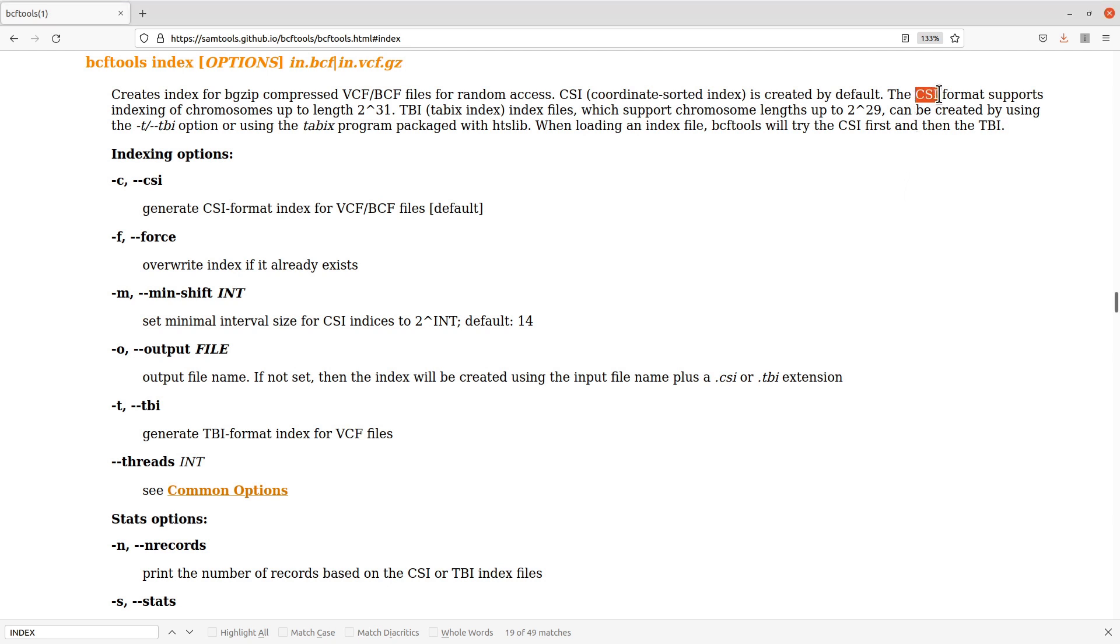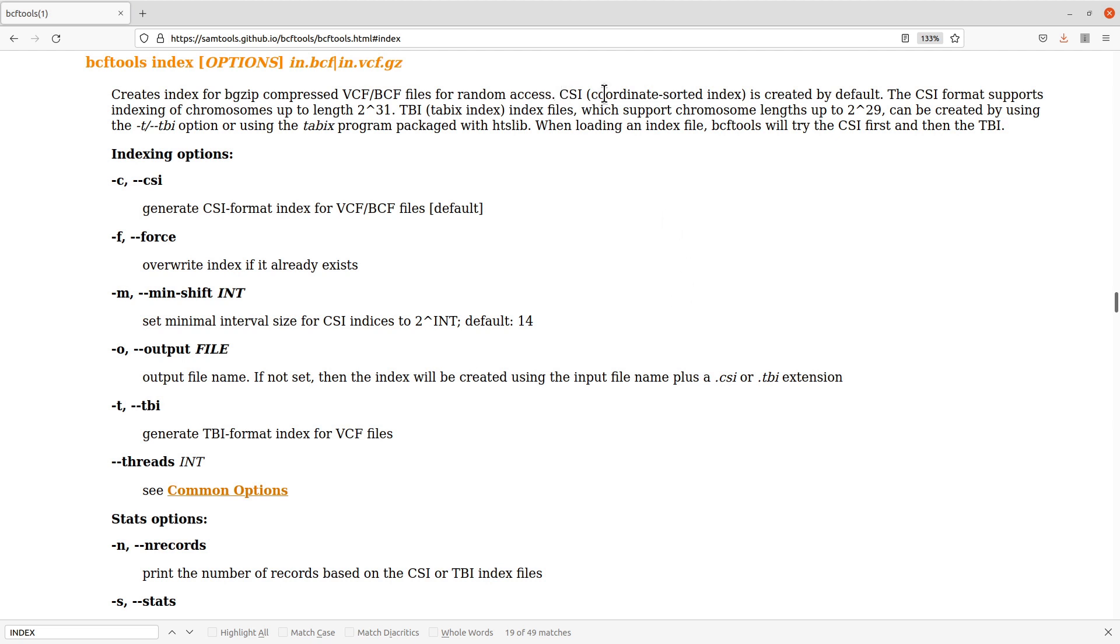We have the first one which is the CSI format, and then we also have the TBI format. Each of these formats can be used for particular scenarios or particular situations. CSI supports indexing of chromosomes up to this length.